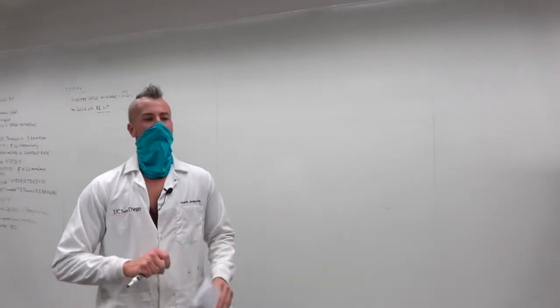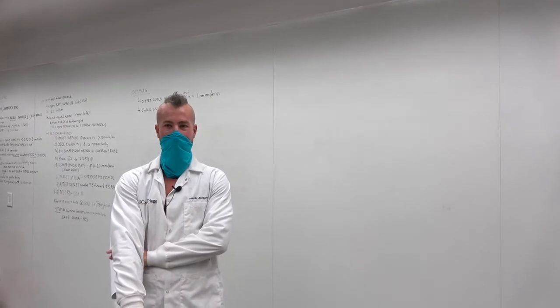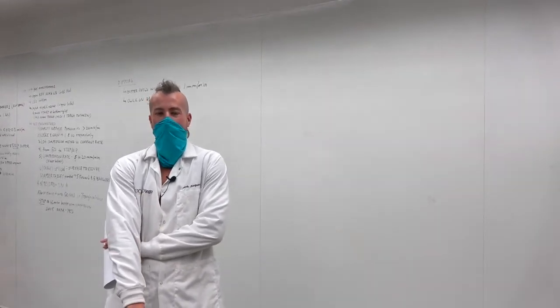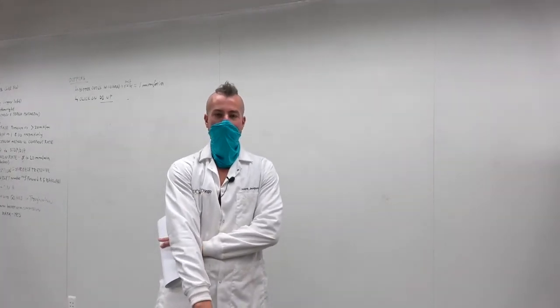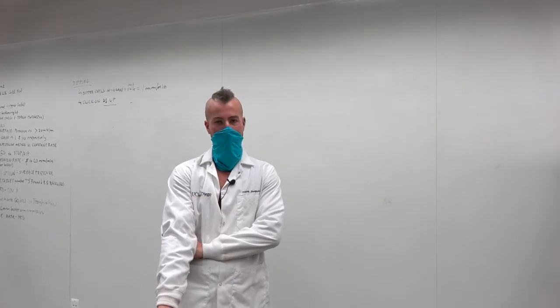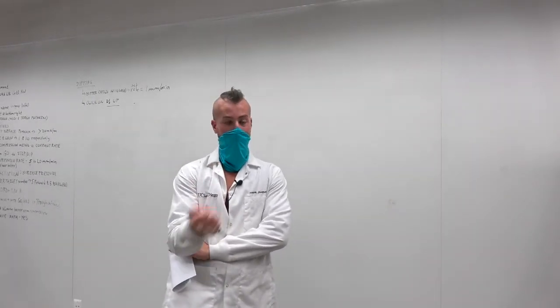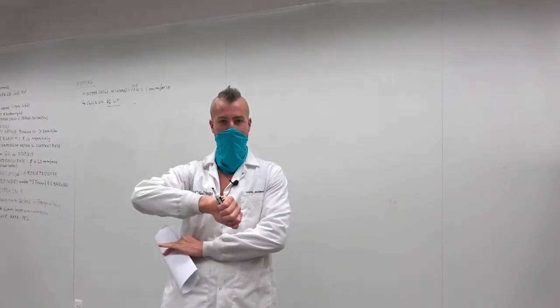document, okay? So what we're doing today is basically making oil and vinegar salad dressing, right? We're doing a water and oil emulsion. And that's the exact same thing that happens when you take vinegar and olive oil and you shake it up before you pour it on a salad, right?